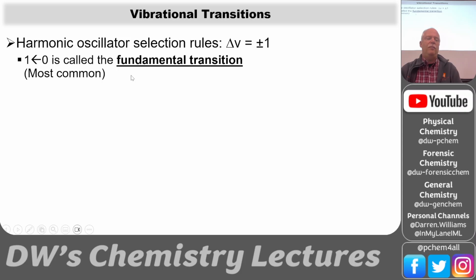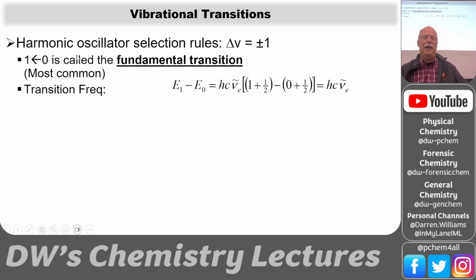Now I'll show it going backwards because originally all of our spectroscopy was done with emission. And so I just don't know why they do this, but the emission was 1 to 0. And so then when they showed the absorption, they just showed it with the arrow flipped. So it's 0 to 1. So just follow the arrow and it's 0 to 1. 0 is the initial state, 1 is the final state. I thought I went through the notes and changed all those, but obviously I haven't. But anyway, that's the old way of writing it out.